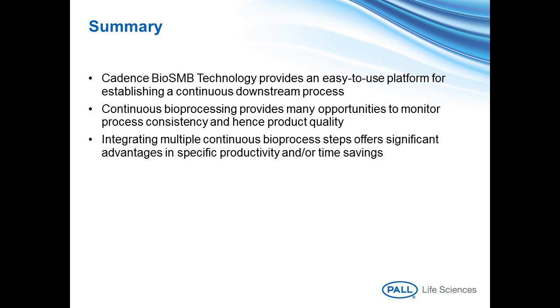Good. And I've got another question for you that would be a great one for you to field, and that's what process variables are used to determine the values in the principal component analysis of the elution peaks?